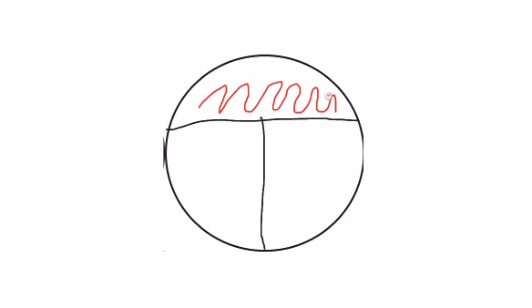At this point, we will sterilize our inoculating loop. I'm indicating sterilization of my inoculating loop by switching colors. For our second pass, we will drag a small bit of bacteria from our first zone and spread it through our second zone, like so. Notice how we did not go back to our source plate. Again, at this time, you will sterilize your inoculating loop, which I am indicating by switching colors again.